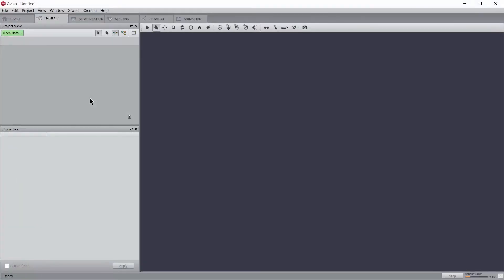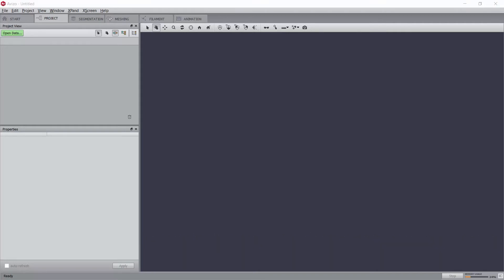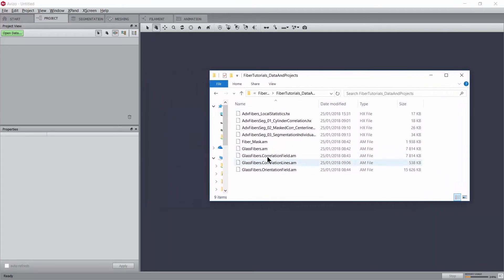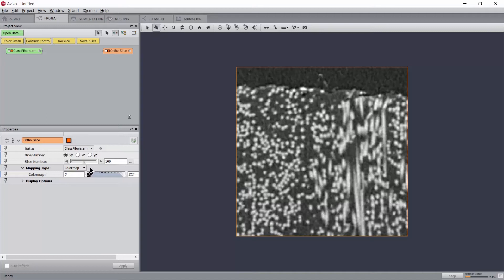In the following, we will use a small sub-volume from a glass fiber reinforced plastic, which you can download from the provided link. You will find there an archive with a dataset and a few associated files and projects, which will help you reproduce the explanation from this tutorial. We start by loading the glass fiber image dataset. It is a small sub-volume from a micro-CT, scanned at 2.5 micrometers of resolution.